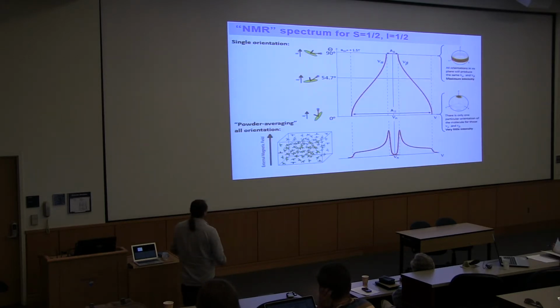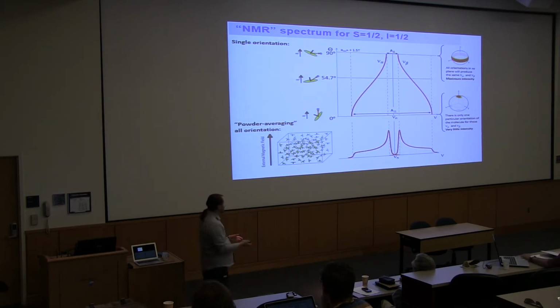And it's like this. What you have to think is how many molecules are there where the dipole vector is exactly oriented with the external magnetic field. There wouldn't be many. But how many molecules will be out there that are oriented so that the dipole vector is orthogonal to the external magnetic field? Well, quite a few more, because we don't care about the angle that is orthogonal to the magnetic field.